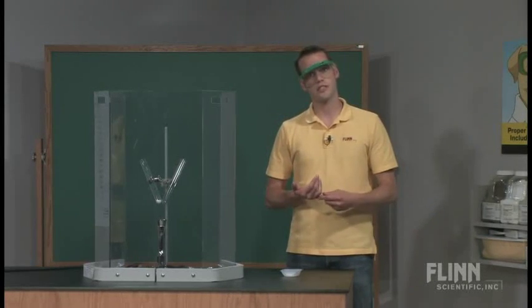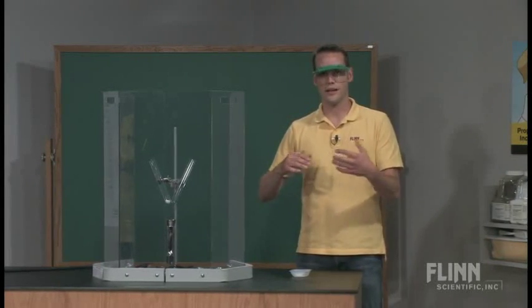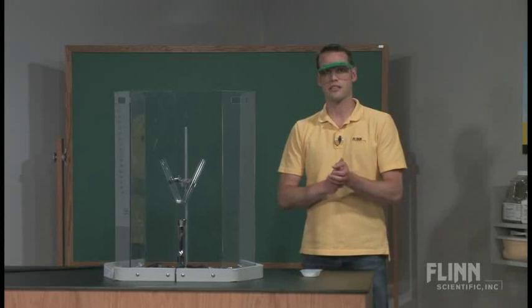All of my students have their safety goggles in the laboratory. I step out of the way more so they can see what's going on, not because I want them to get hit with whatever is going to happen. But there are four walls now. When you pull the sash down, they can still see everything that's going on.